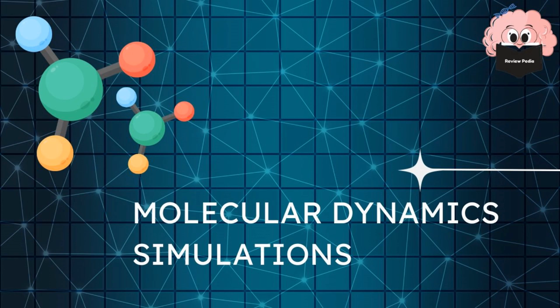Here I'm using Desmond as an interface to perform these MD simulations. I'm going to show you each step of how you can perform MD simulations, and lastly I'll be showing you how you can analyze the RMSD plot of the protein and ligand complex. So let's just dive in.